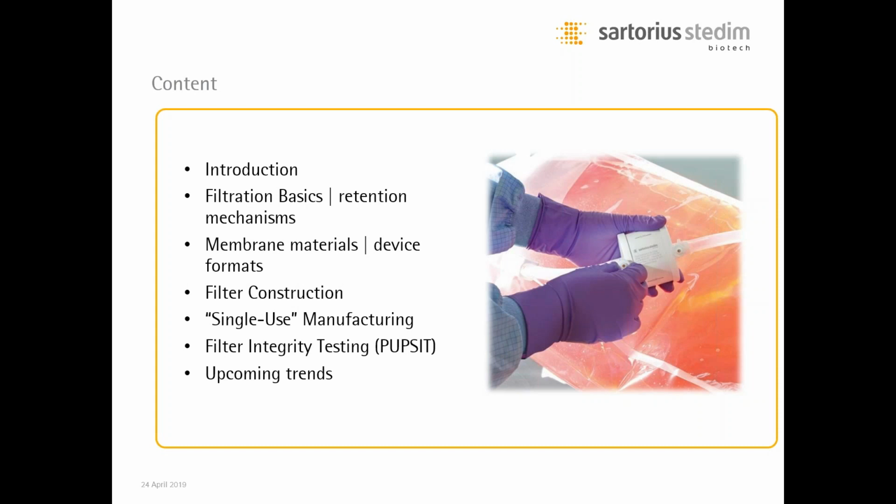Single-use manufacturing, some specialties also about filtration. And then finally the topic of filter integrity testing. There is a big discussion ongoing about PUPSIT, pre-use post-sterilization integrity testing, so I want to give you the latest update here, and finally some upcoming trends.